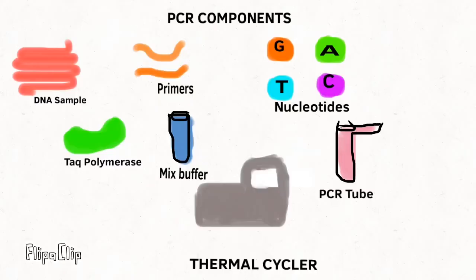Okay, so PCR, which is polymerase chain reaction, occurs in vitro, which just means that it's all occurring within a test tube. So here you can see the materials that are placed inside the test tube, and PCR basically just makes you a lot of copies of a particular fragment of DNA. You might ask, why do we even want a lot of copies? Well, it's because we want to clone these fragments into a plasmid, which we will discuss a little later.